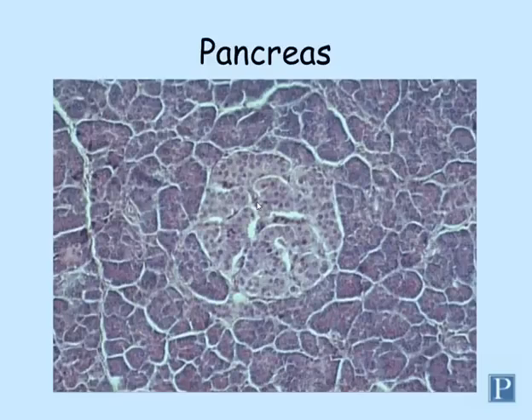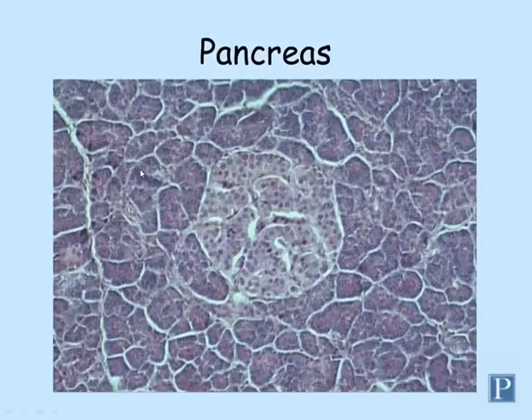This is a high magnification section of the pancreas. We've seen this one previously as part of the digestive system because part of it is actually exocrine tissue. This gland has a dual role — about 98% of the tissue is exocrine, composed of these serous acini.